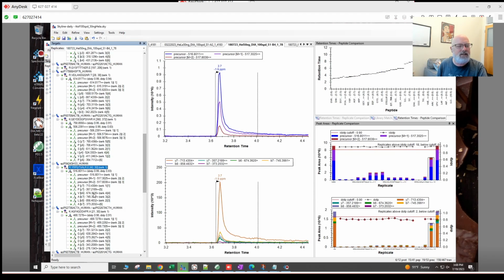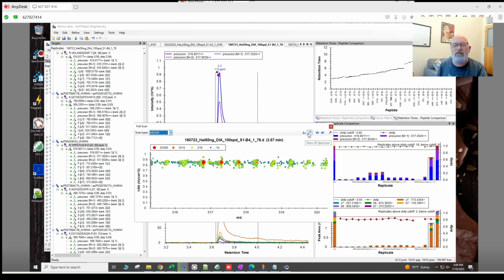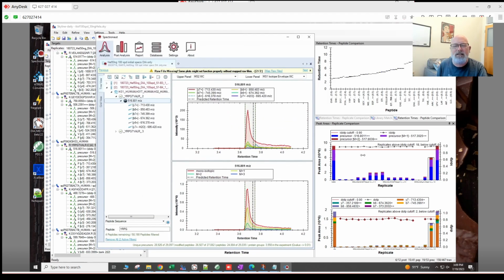Let's look through here. What else is interesting is the peak annotation, 2D spectrum. So you can see the ion mobility here. It did import the ion mobility. So here's the 1 over K naught of 0.8 something for this peptide. I find Skyline a little hard to read. It's hard for me to make sense out of it. Maybe I'm just not used to it.